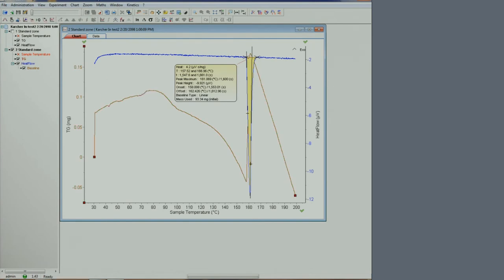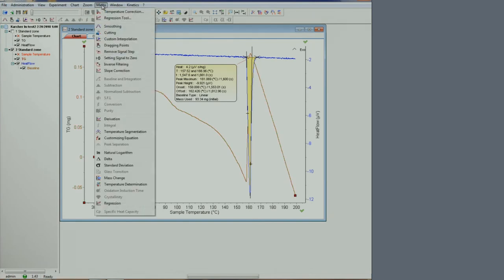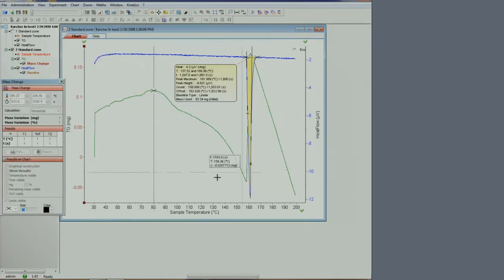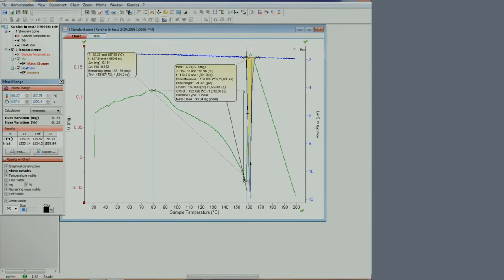Looking at the mass flow curve, we have access to a different subset of analysis options. We can look at the mass change between the start and end point, providing time and mass difference. The information box can easily be moved around by clicking on it.